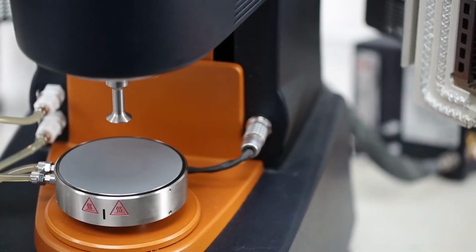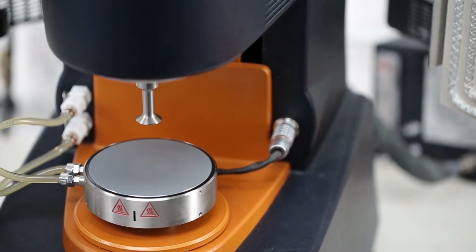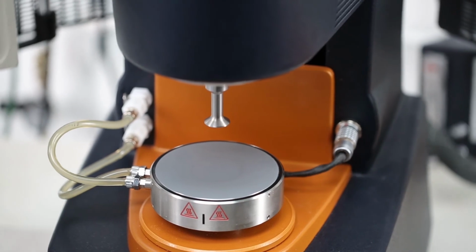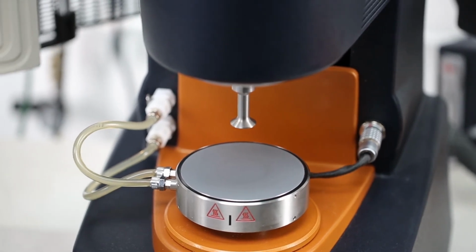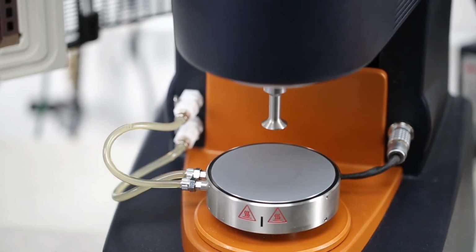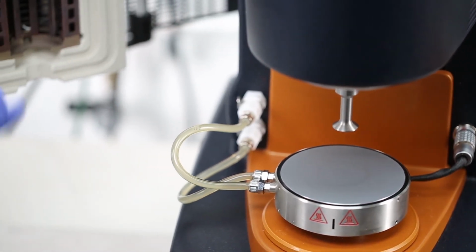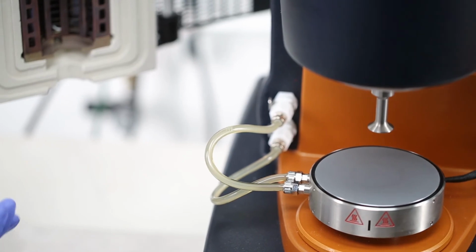Now we're going to use a controlled stress rheometer to test the viscosity of the same polymer. The CSR has better precision and accuracy than the Brookfield, and it can also test at temperatures from -150 degrees C to 600 degrees C to better mimic your actual manufacturing conditions. Centrifuge or de-air your sample before you test.